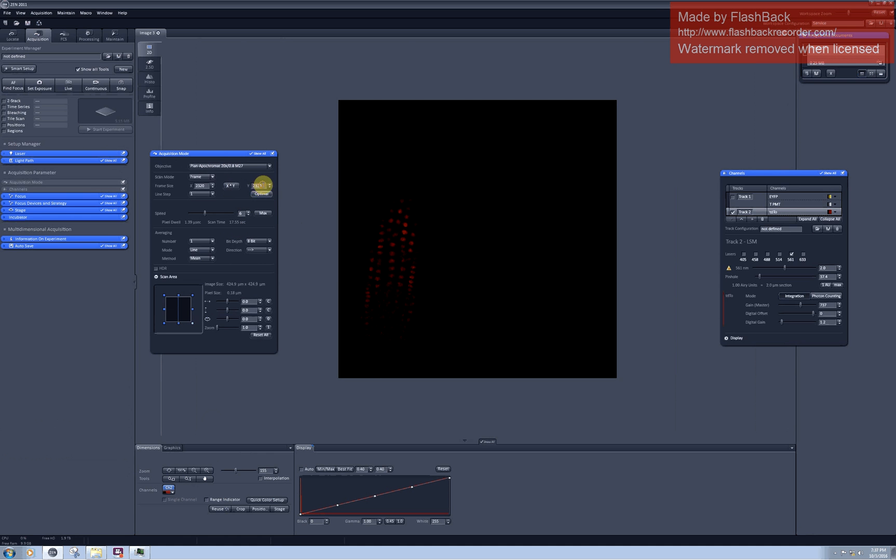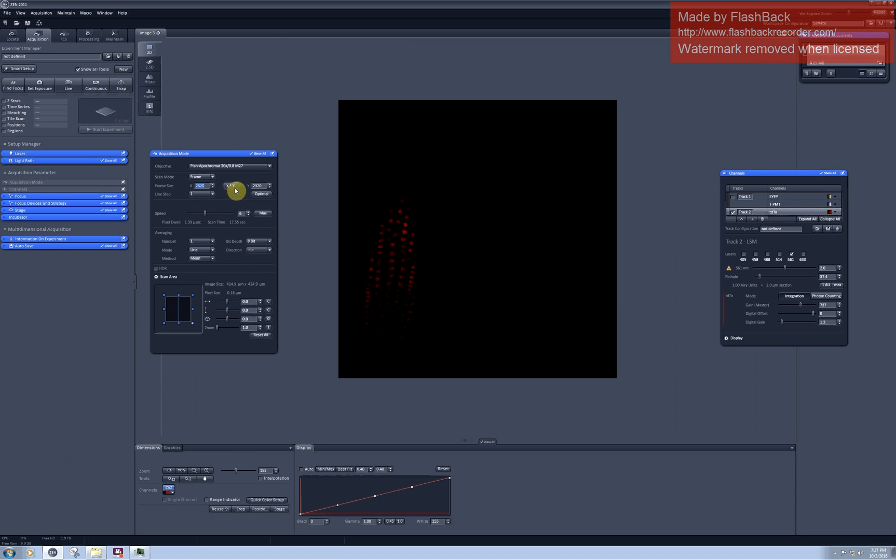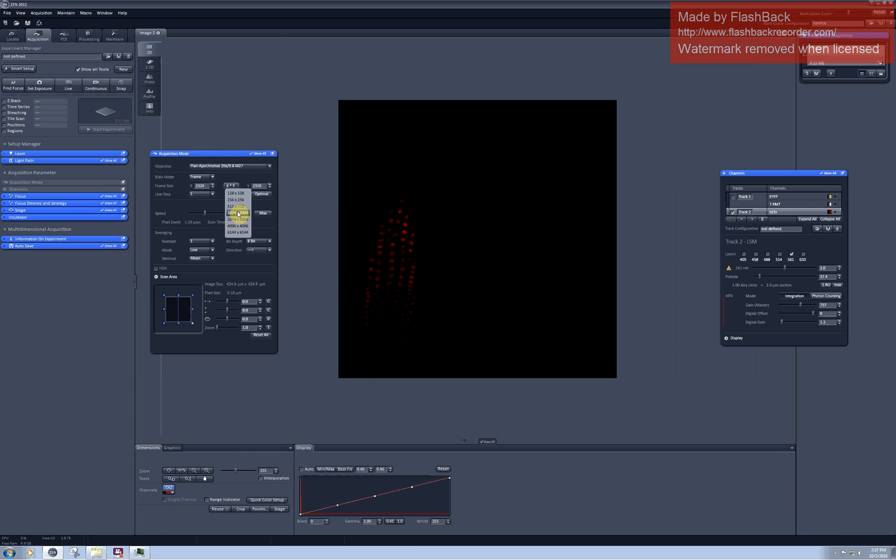You rarely need to have 2320 by 2320 pixel images. It's rather poster size. Usually this resolution will be sufficient for most publications, but be aware that sometimes you will need to crop your images and then it will be better to go to higher resolution.